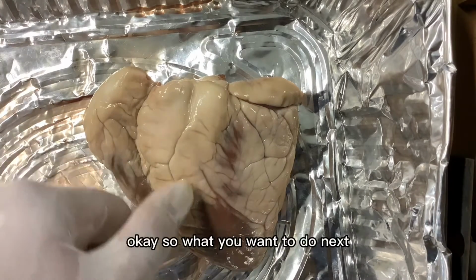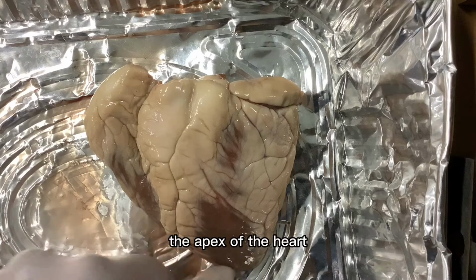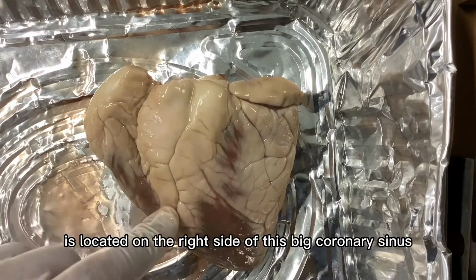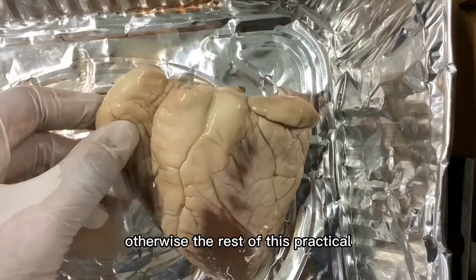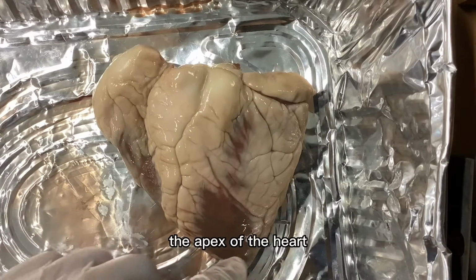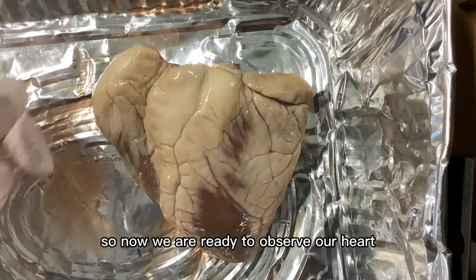What you want to do next is to place your heart in such a way that the apex of the heart, which is the pointy part of the heart, is located on the right side of this big coronary sinus. You don't want to place it the other way, otherwise the rest of this practical might be quite confusing. So make sure that before you proceed, the apex of the heart is on the right side of this coronary sinus. Now we are ready to observe our heart.